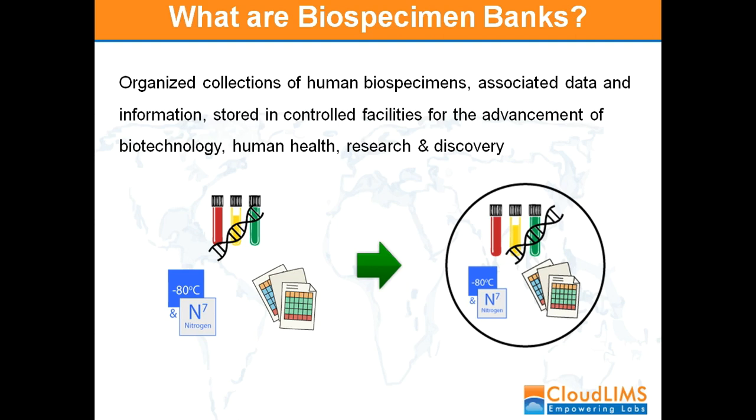So generally, we can say that a biobank consists of three groups of relatively distinct information. The first is biological human material. The second is attached or connected information. And the third is the legal issues like consent and patient or individual data safety and protection. And this makes the science of biobanks so comprehensive and complicated because it requires a multidisciplinary and universal approach in all stages of the life cycle of the biobank.